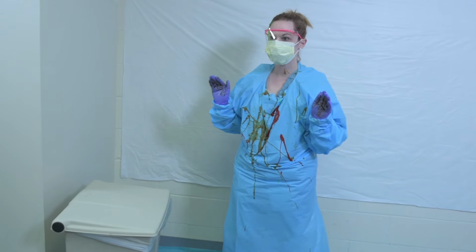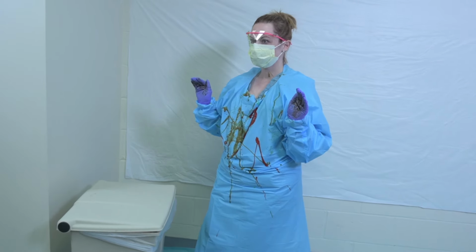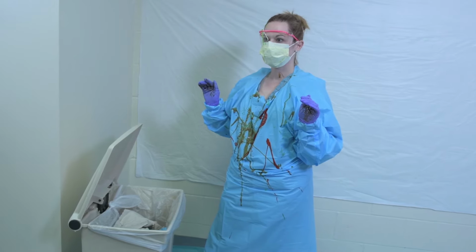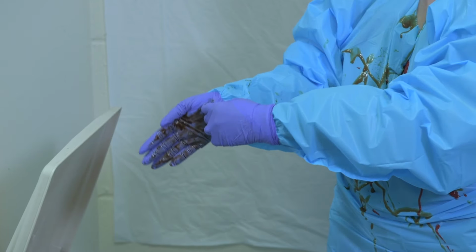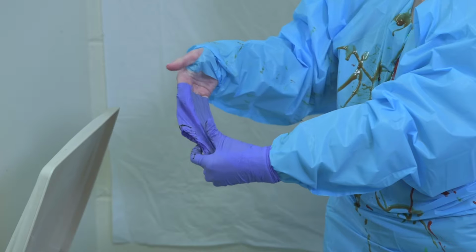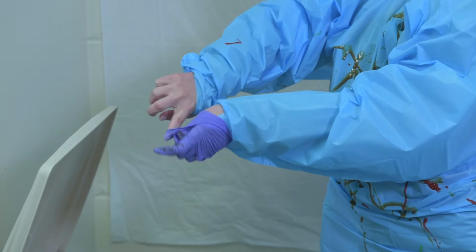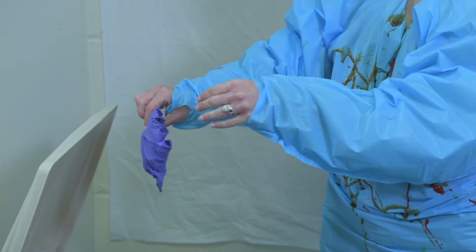Doffing or removal of PPE should be done slowly and intentionally to prevent contamination from aerosolizing or being thrown into the air. Grasp or pinch the first glove at, not inside, the cuff. Peel and turn outside in. Hold the removed glove in the gloved hand and slide your ungloved finger under the cuff, touching the clean inside only. Peel off over the first glove.